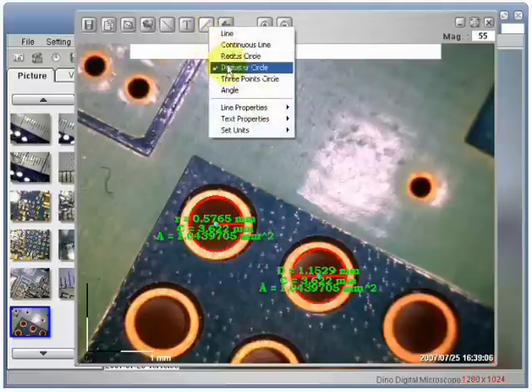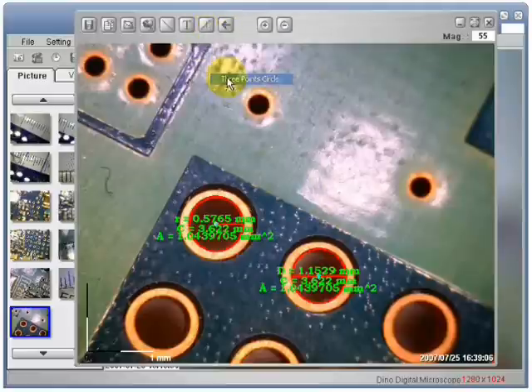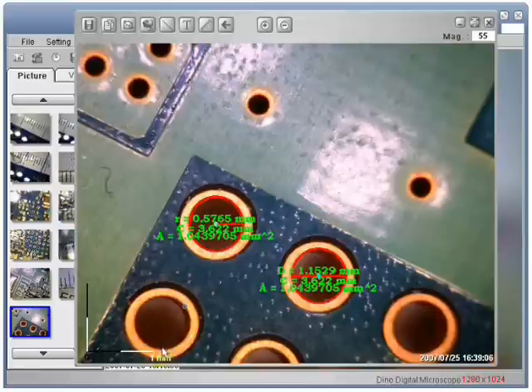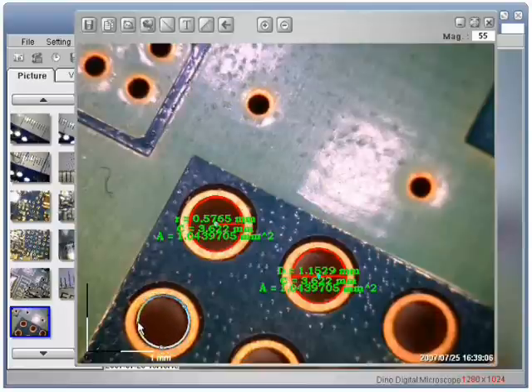Now I am going to choose to measure with three points of a circle. Left click one time to start. Left click again for second point. Left click one more time to finish.